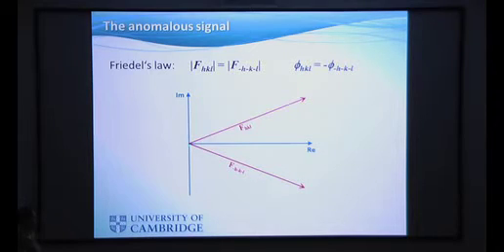These two vectors have the same length, meaning the two reflections will have the same intensity, and the phase of one will be the negative phase of the other, and you can easily see this from this picture. This holds approximately true for most atoms in most situations.